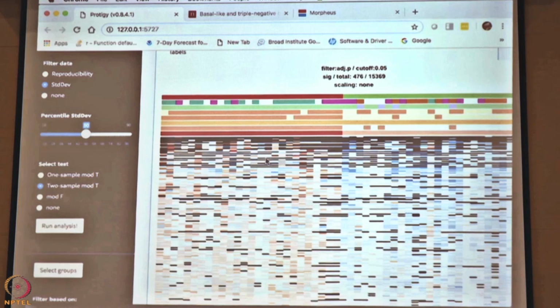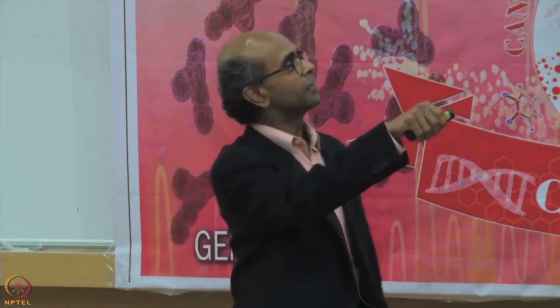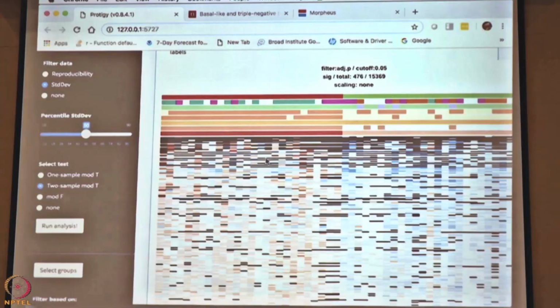Would you really believe it? I wouldn't. So this is a strong indication that you really need to filter to remove proteins that are missing in too many samples. If you did that, this would get chopped off somewhere here, and after that, it's fine. You have missing values here and there, it's okay.